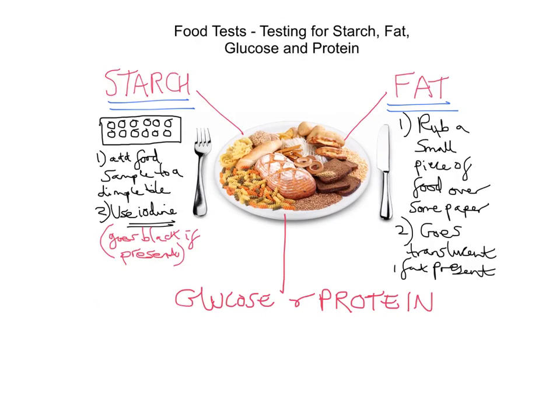And protein. And I've put them from the same sort of red line because they start the same. They both have the same method to begin with.